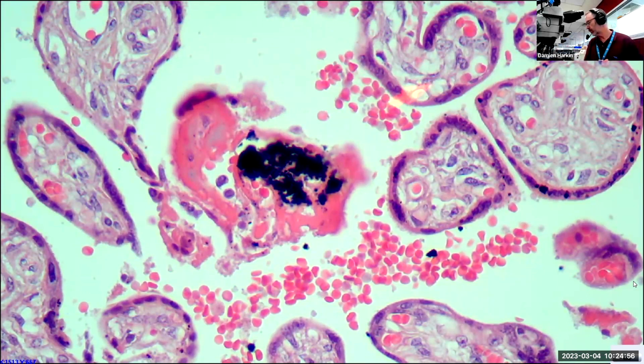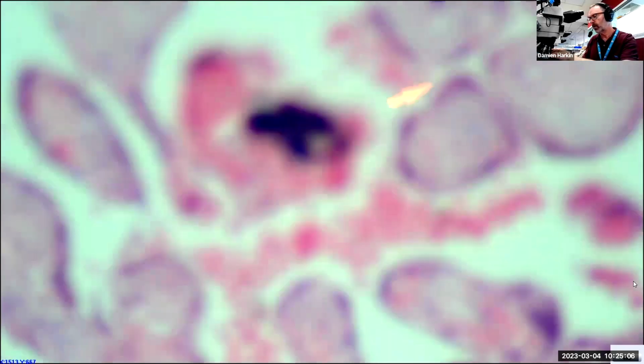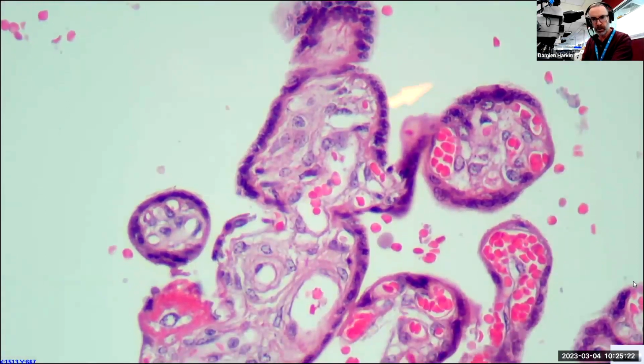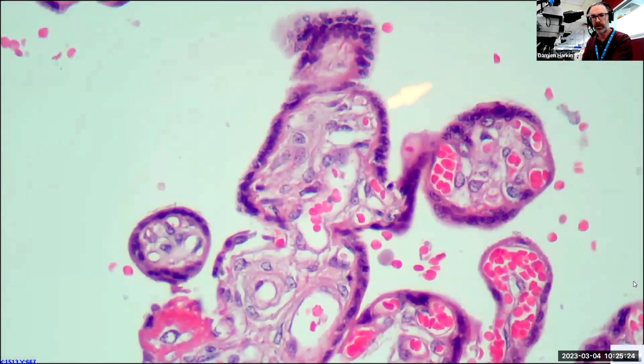Well, as I mentioned before, there is a rather simple technique for removing formalin pigment. To do that, it involves taking the section down to water like you would normally do, and then prior to doing anything else, you soak the slide in a saturated alcoholic solution of picric acid.